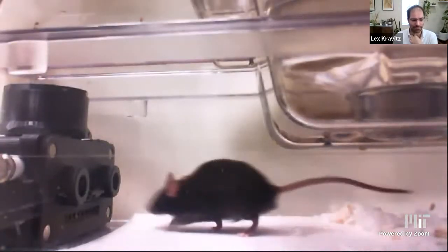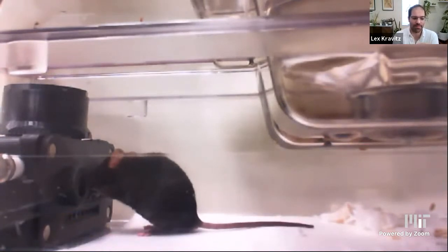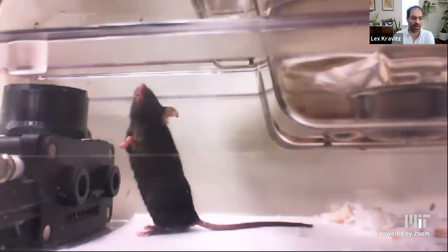This is now one of these first generation devices with the nose pokes. But now the mouse can poke his nose and take a pellet. So that's about as simple a game as the mouse can play. And I kind of alluded to the fact that we can program it to do any sort of complicated game to get at the learning of the mouse or its persistence or willingness to work to get pellets.